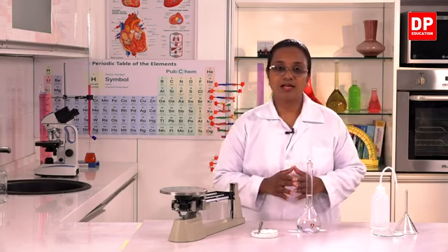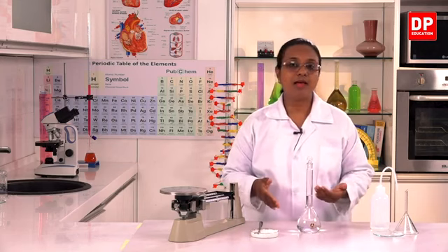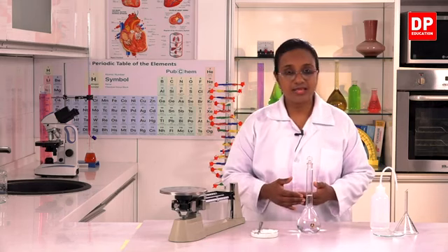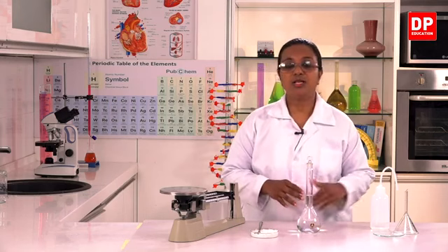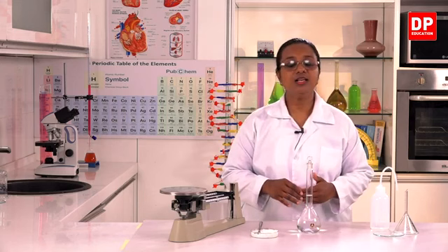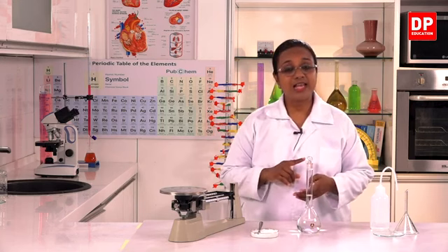So once that is done, you can't leave it like this, because there are instances where many people work in the same lab, and you might need to make more than one solution which look the same. So then we have to put a label for the solution so that we can identify the solution easily. And what do we include in the label? We have to write the solvent, the solute, the name of the solution and the concentration of the solution, as well as the date on which the solution was prepared.